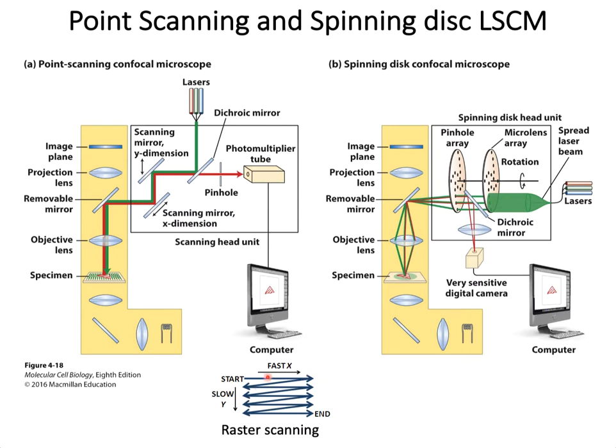So what do we achieve from this? Remember that with a single point being scanned by the laser, only that point will emit the fluorescence, which will pass through the dichroic mirror, and the data will be recorded. Except for that one point that is being scanned, which receives the laser excitation for the emission of fluorescence, all other points are completely dark and there will be no background fluorescence. In addition, if any background out of focus light is emitted, the confocal pinhole will eliminate it.